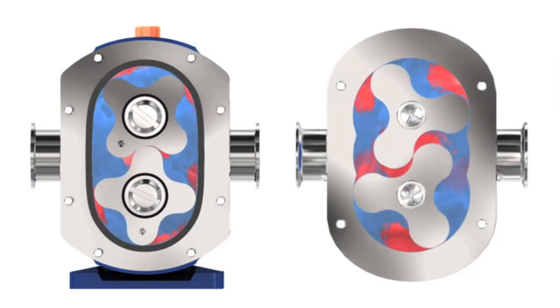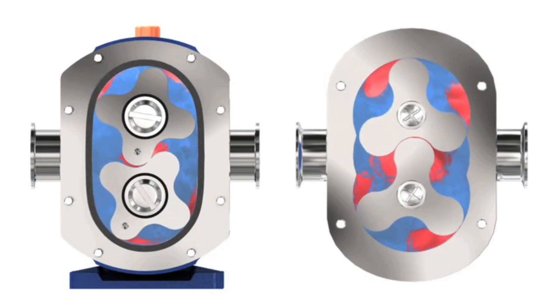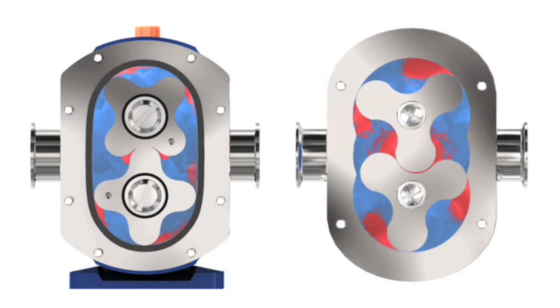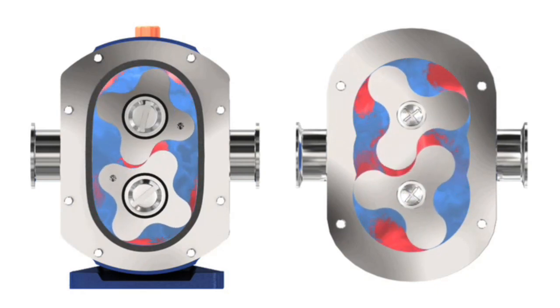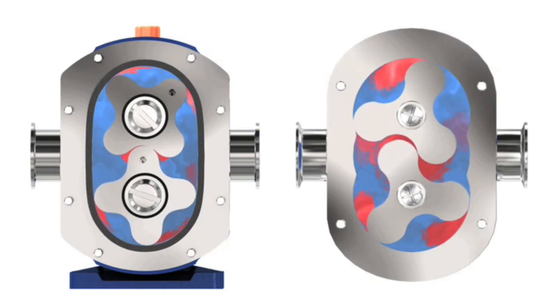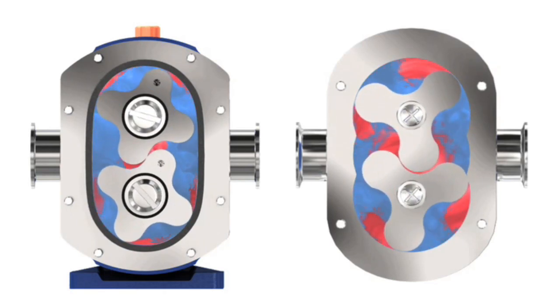the SX incorporates close clearances to minimize product slip. The forelobe geometry reduces shear of the liquid as it enters and exits the lobe cavity, and also reduces pulsation. It's perfectly suited for both cleaning in place and sterilization in place.